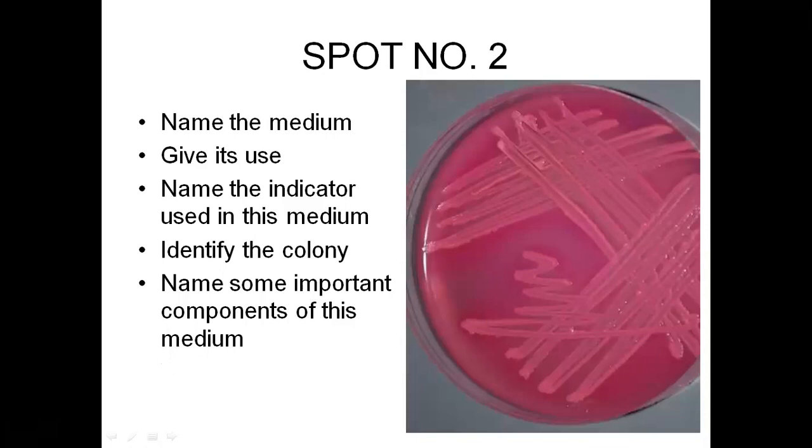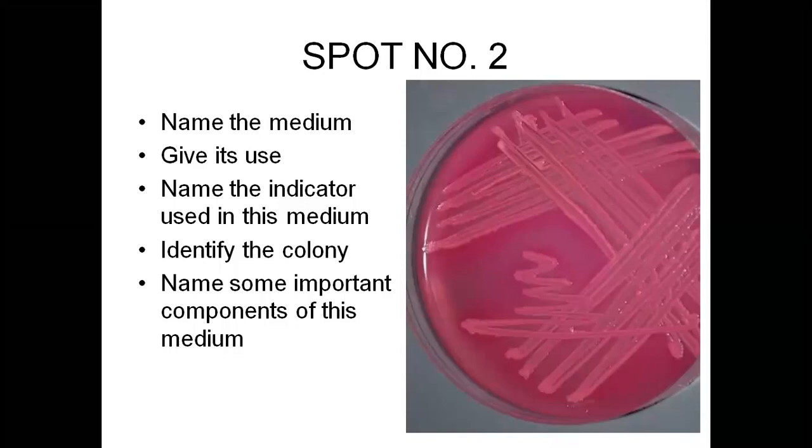So another spot is this is a culture medium, pink in color. This is MacConkey's agar. This agar is used to differentiate between lactose fermenters and non-lactose fermenters. Lactose fermenters and non-lactose fermenters are mostly gram-negative rods. So this is a solid culture medium.